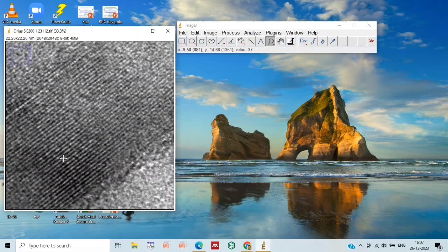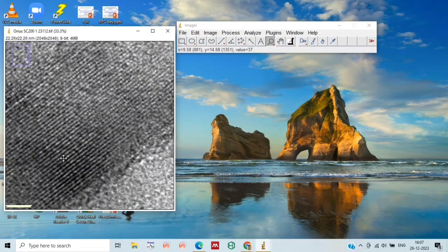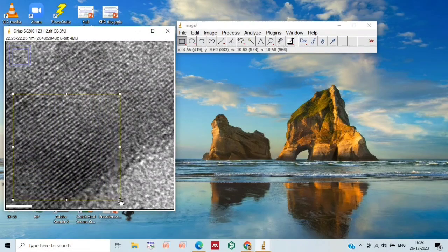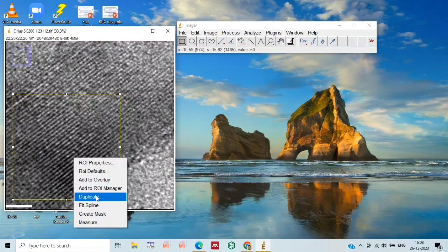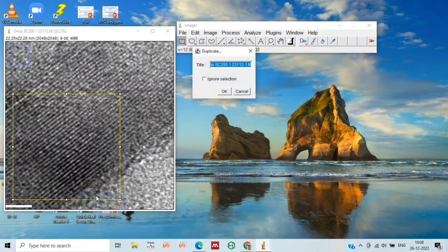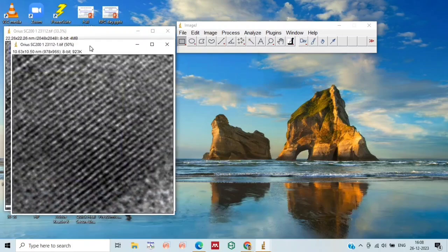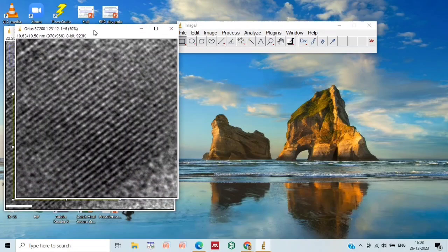Let's select this region, then just duplicate it, so we will get this large zoomed-in image.